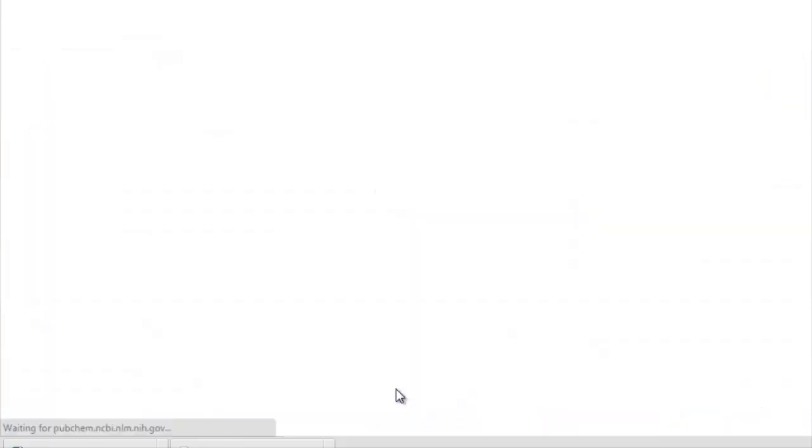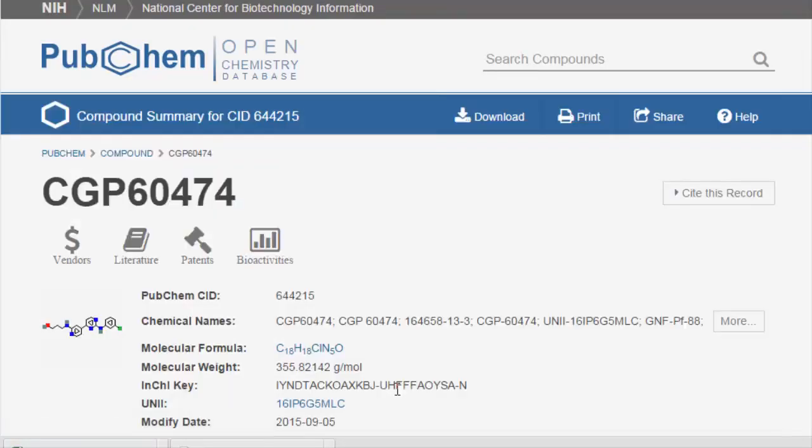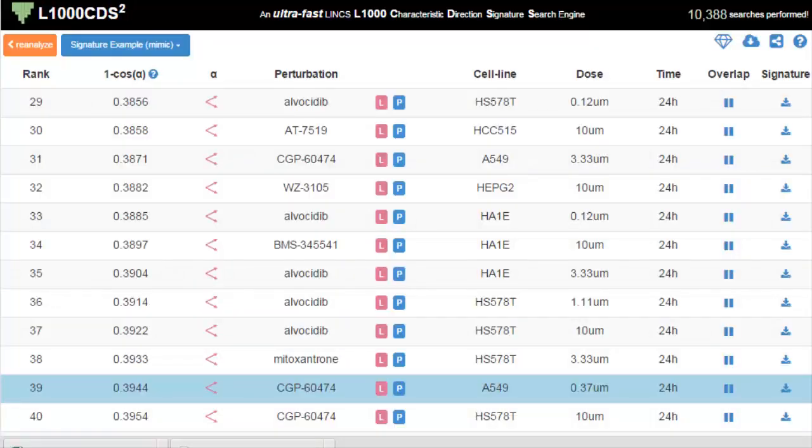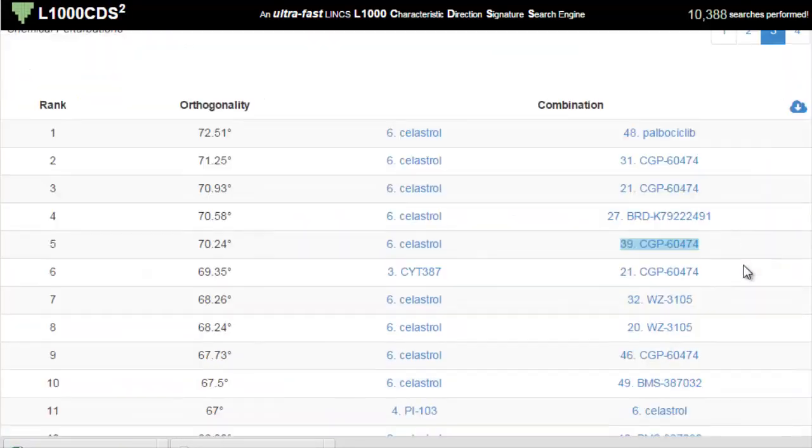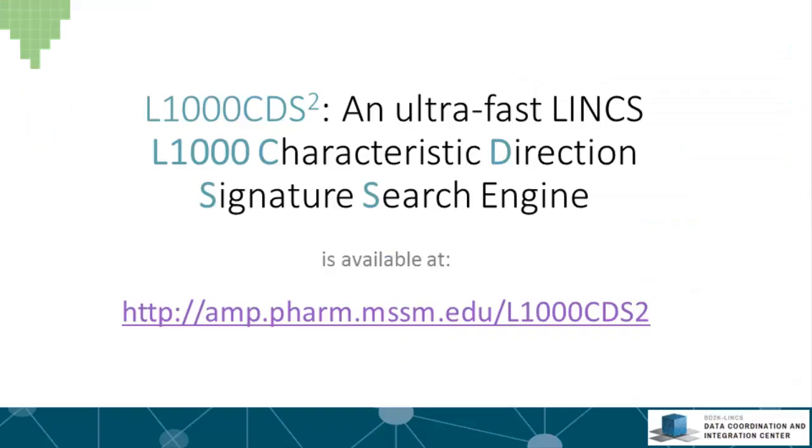This allows the user to learn more details about that specific perturbation. Clicking on the cloud download button on the upper corner will download the combination table as an Excel file. This tool, developed by the DCIC using the data developed at the Broad Institute Transcriptomics LINCS Center, is a powerful tool for drug discovery and systems pharmacology. In the course, we have the opportunity to use this tool to predict drugs for many diseases by combining another tool called GEO to Enrichr that will be demonstrated later in the course.